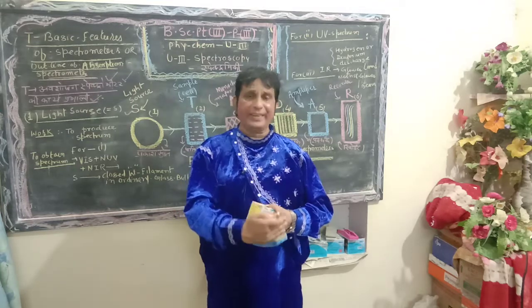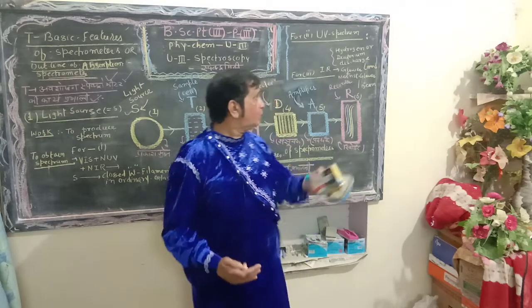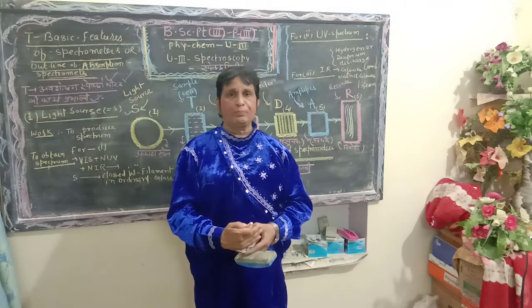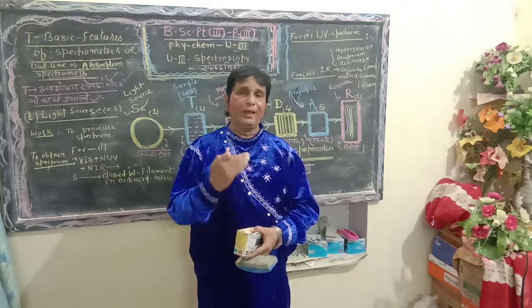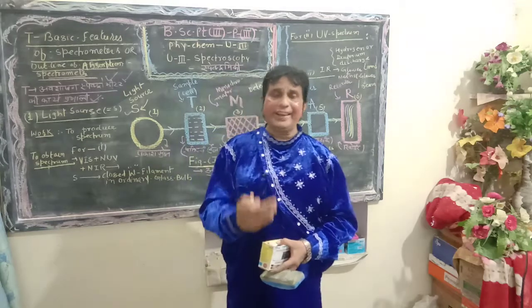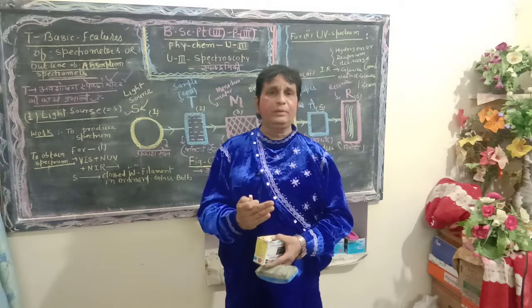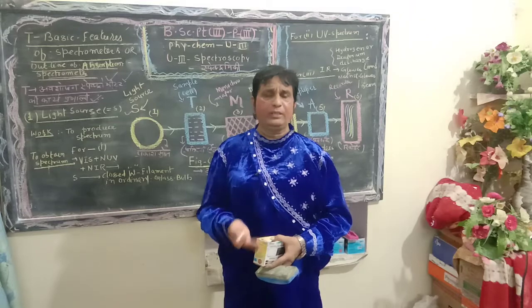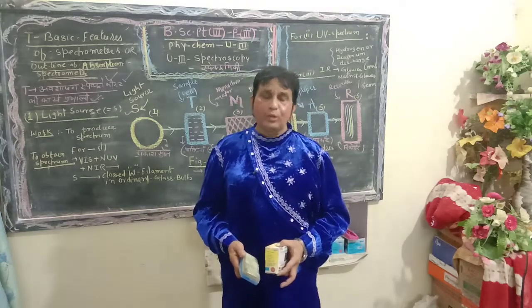we connect a device like a prism or a diffraction grating in the way of the spectroscope. The unwanted wavelengths, the other lambdas, will be absorbed by the prism, and of the rest of the radiation, a single light will be allowed to transmit and pass onto a photographic plate, in other words a recorder.